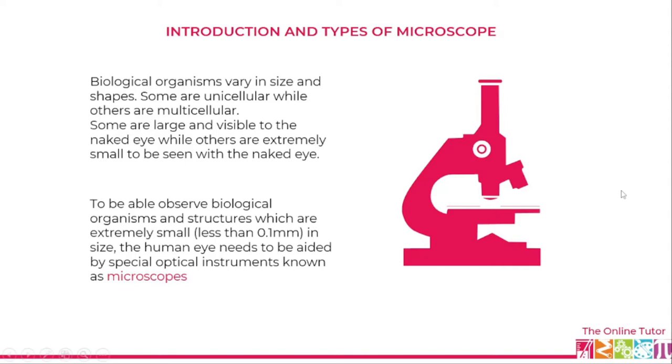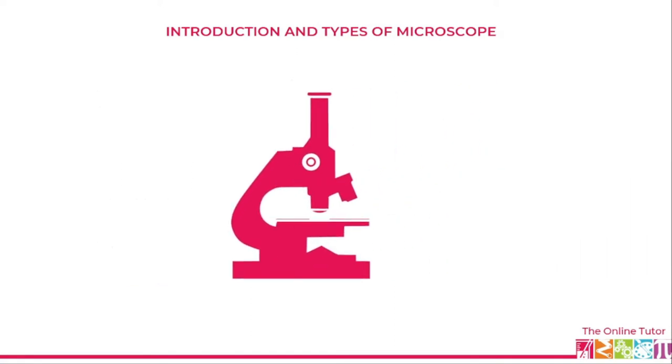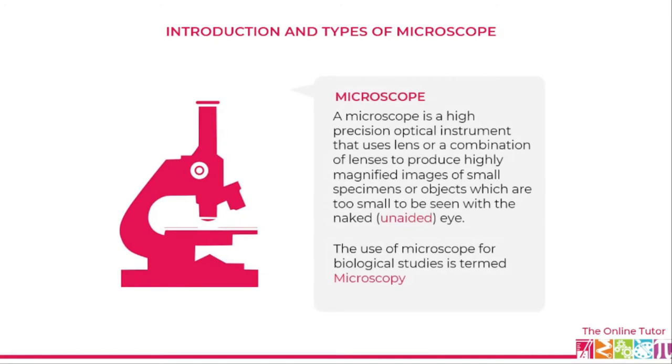And hence the reason why we want to look at or study what microscopes are, and then their various uses, and then the parts, and then how to use the microscopes to observe biological organisms. So what then is a microscope?